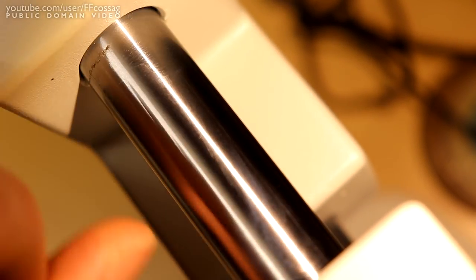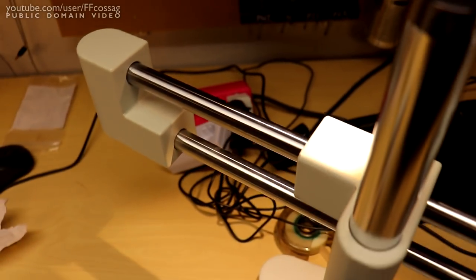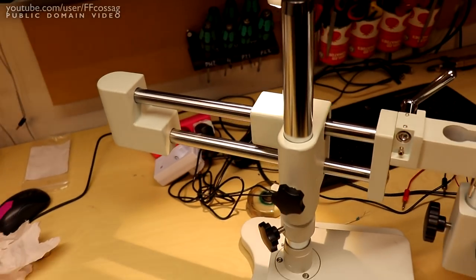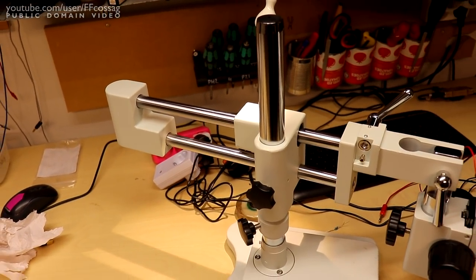And that is actually getting worse with every insertion. I can feel that with my nail. So the quality of the bearings they use is so poor that they're managing to damage a hardened steel arm. Which is not impressive. I'm not happy with that.